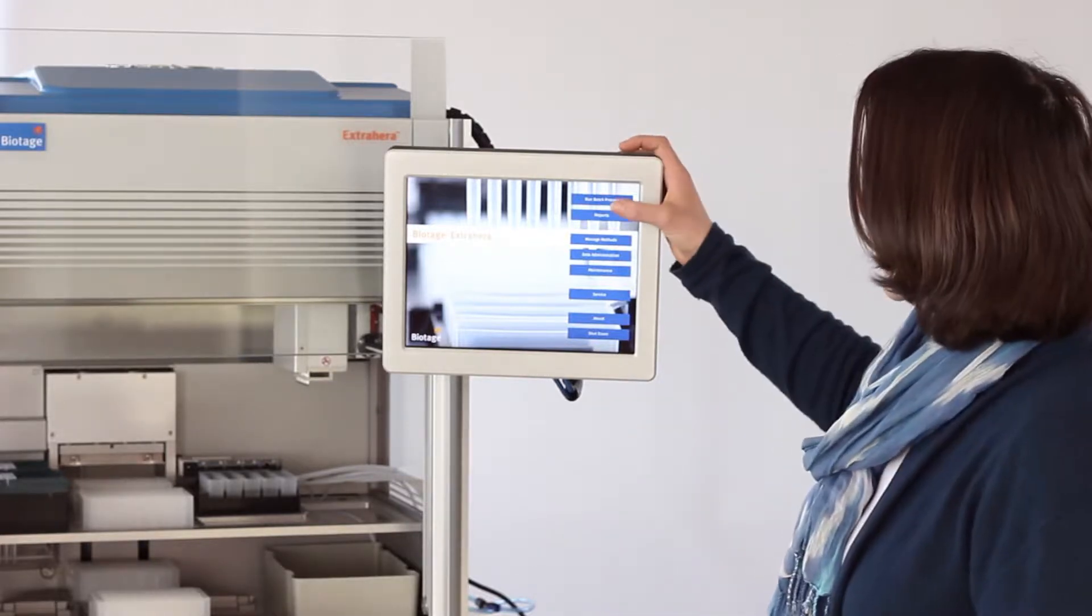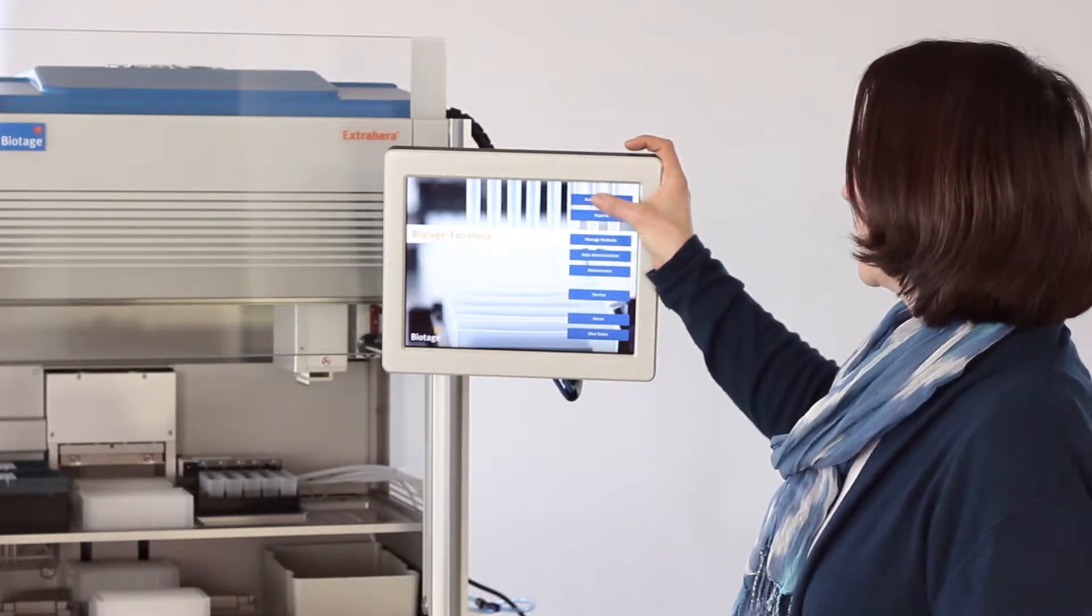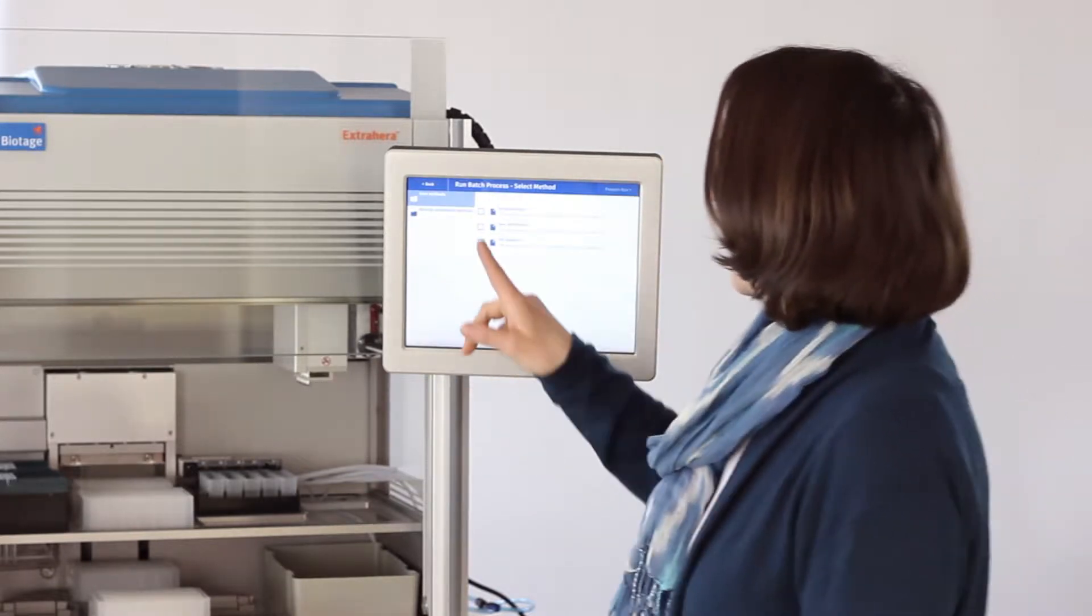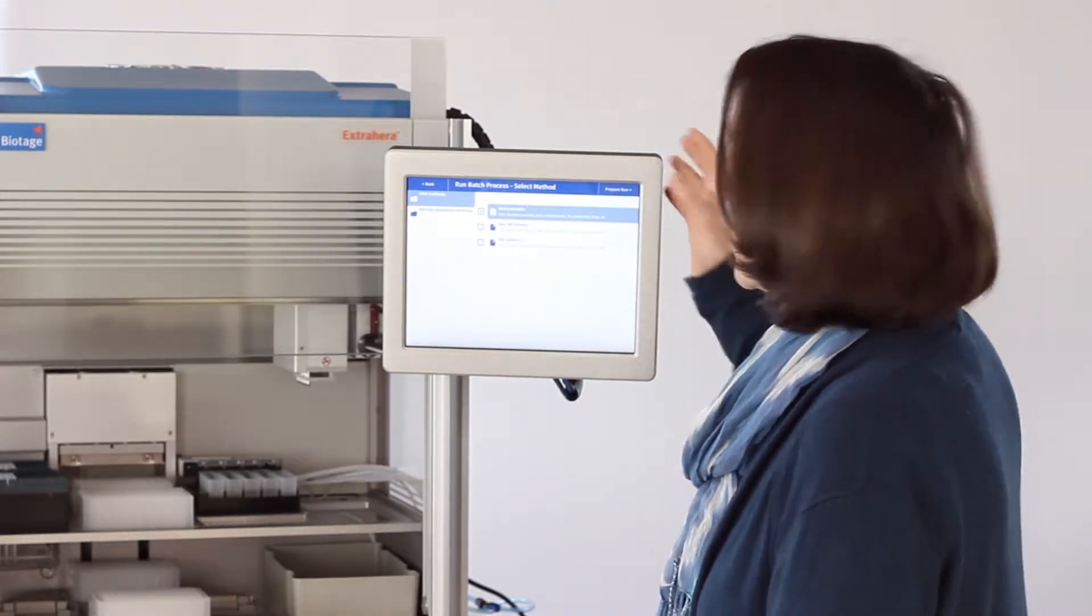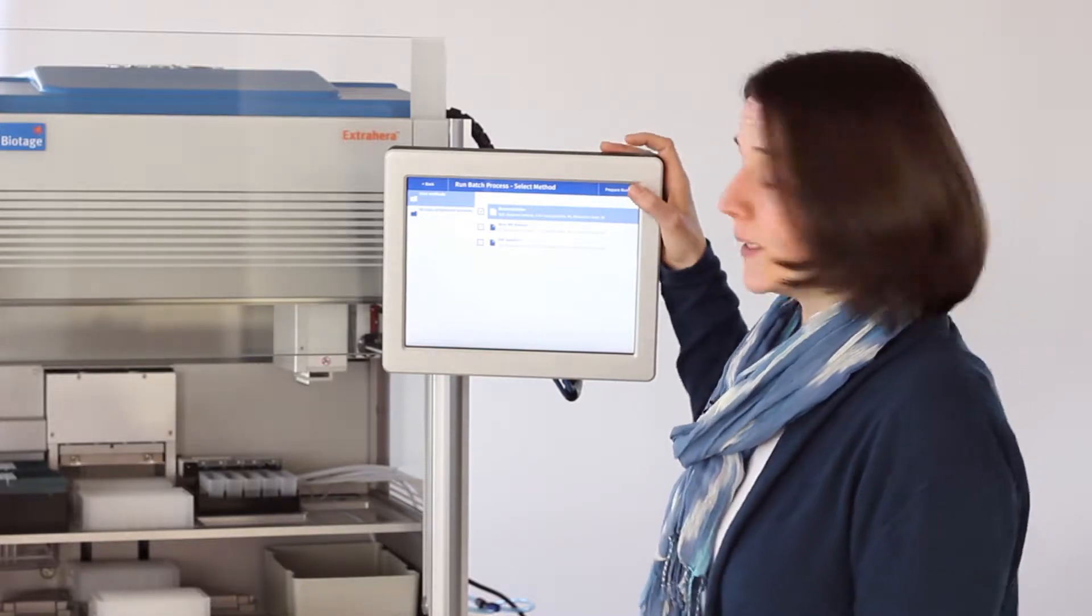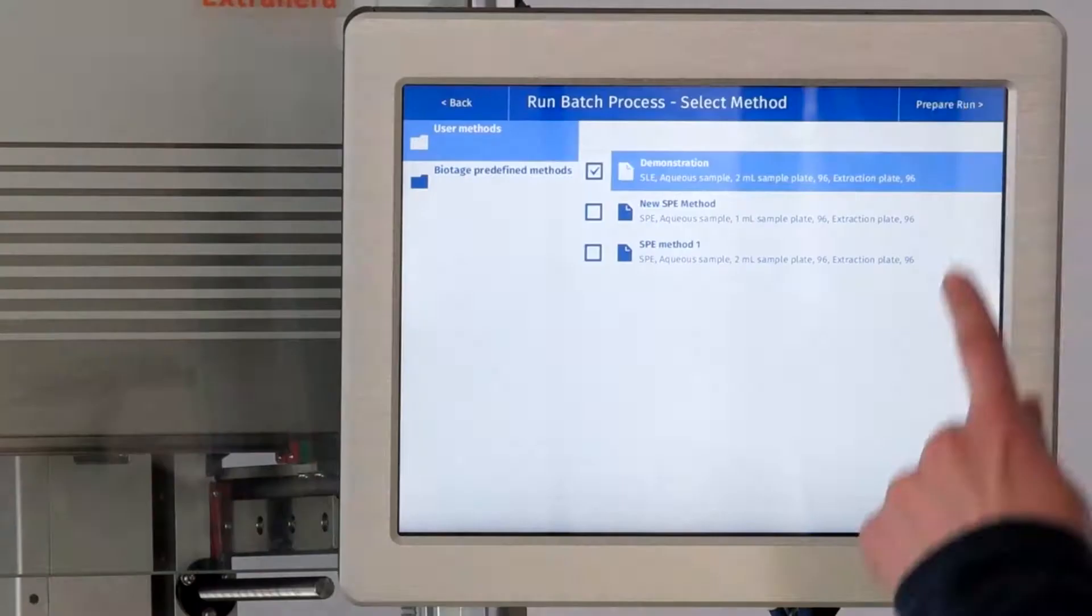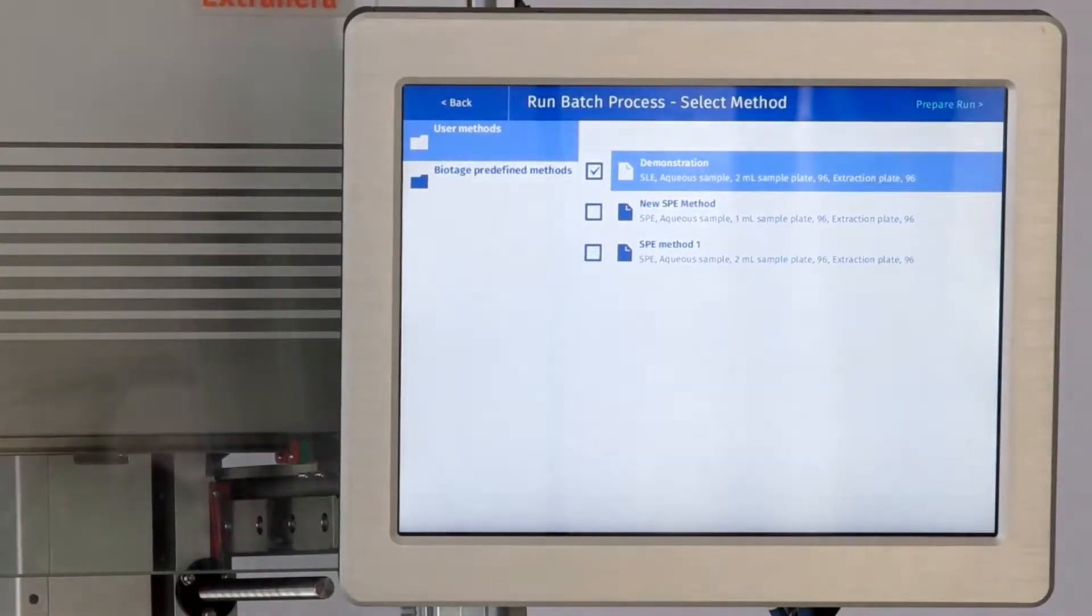We need the run batch process button and we'll pick up the demonstration SLE method that we prepared in an earlier video. So prepare run.